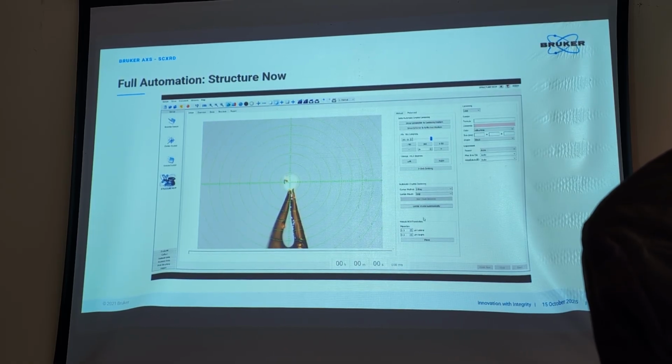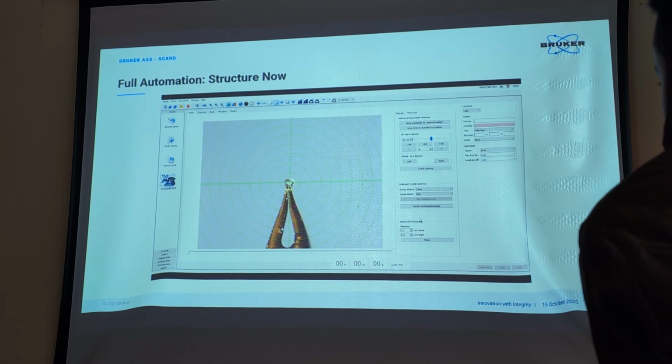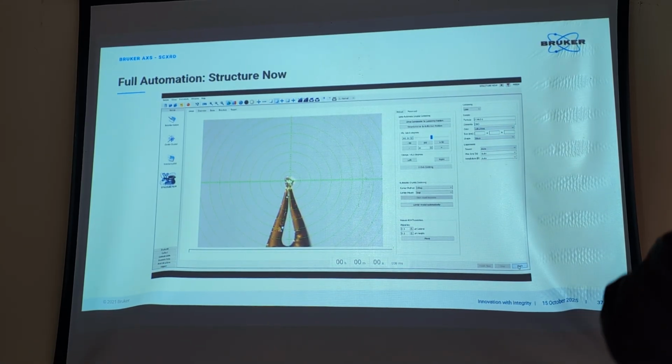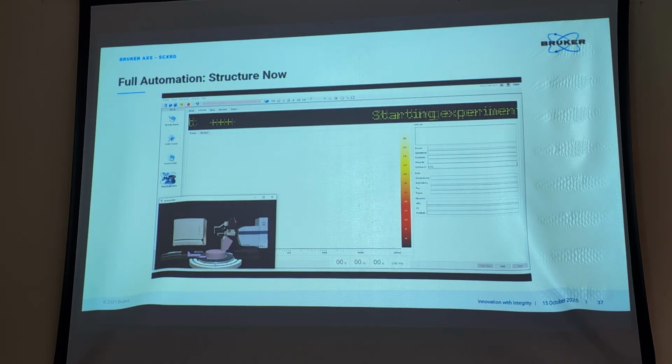It can take from a few minutes to a few hours. If your crystal is good, you will get your preliminary structure in a few minutes. But if your crystal is bad, it can take a few hours also. Data collection can vary again from maybe 30 minutes to 1 hour to 4 or 5 hours. Analysis can take some more time depending on your skill set, how quickly you can do it. Most of the time nowadays, most of them are automatic.